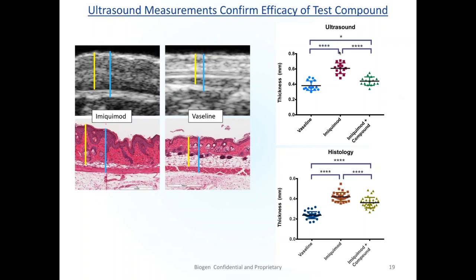Just a question about the hair removal. We've heard this before, that the hair removal cream, typically Nair or Veet or something like that, uses some kind of chemical to dissolve the hair, so this can affect the skin. Did you try just using clippers to shave the hair, and then just using water with gel on top or anything like that?